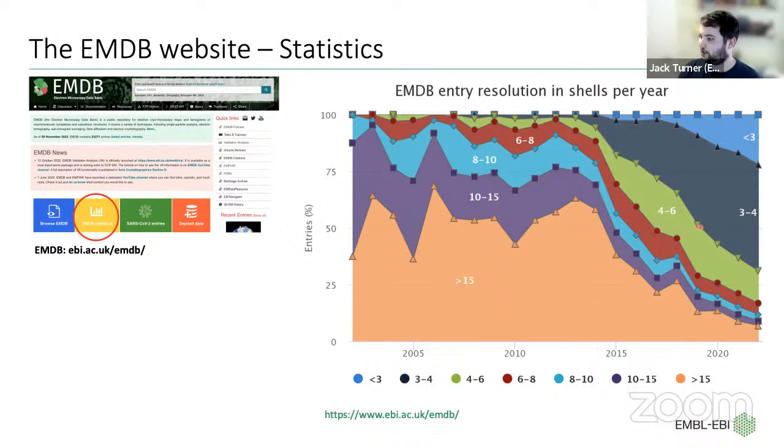We then get sub-4 angstrom structures becoming very common from 2018 or 2019 onwards. And sub-3 angstrom structures are on their way to become sort of 25% of the yearly releases. Actually, I checked, and we're currently seeing an increase in sub-2 angstrom structures as well, which is quite interesting. Not to say, of course, that you can't still get a lot of interesting information from low resolution structures, but we can see that the resolution revolution really hasn't stopped. People are still getting higher and higher resolution structures.